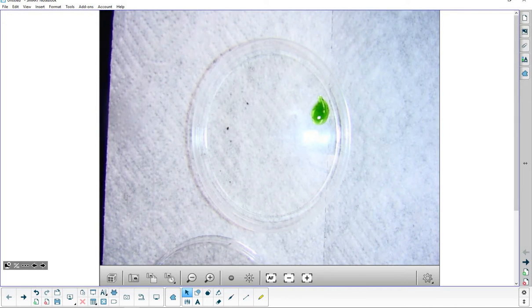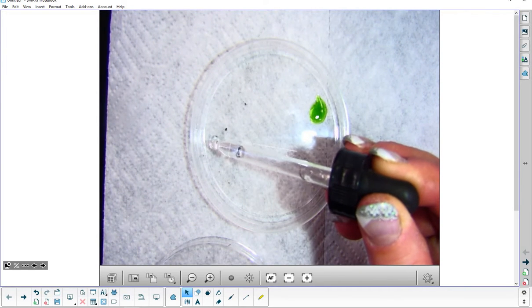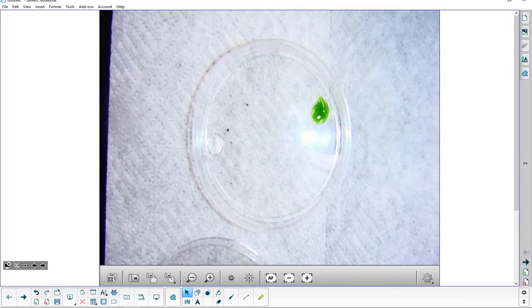So I want to have minimum of 3 trials because I want to be able to see the trend. 3 is the absolute minimum. 4 is better. 5 is even better because you can see trends better. Okay? If you look at the R value for something that has 3 points, it's a lot worse than the R value for a line that has 5. Okay? You can actually get closer to what you need to do. So I'm going to say that I'm going to use 6 drops. Just to be consistent here, I would be doing this several times, but I'm going to do 3 drops.